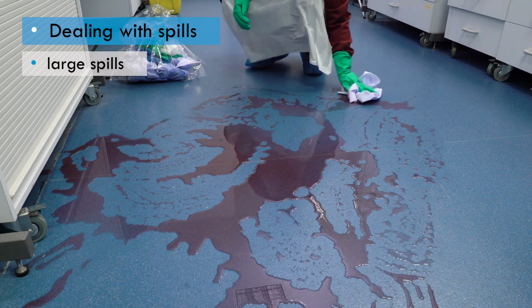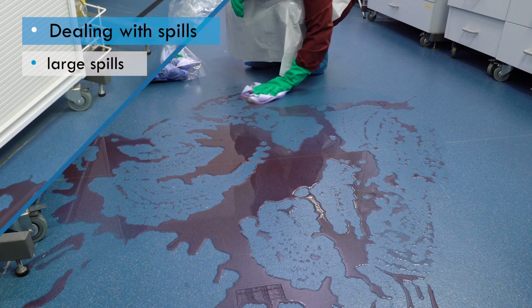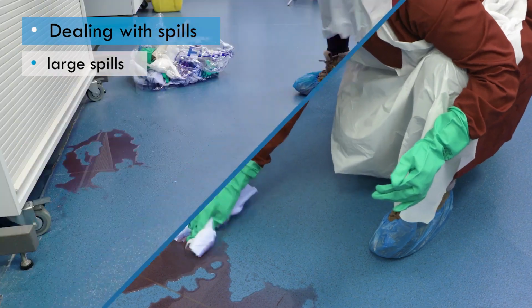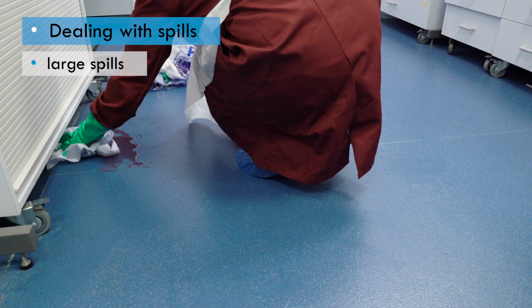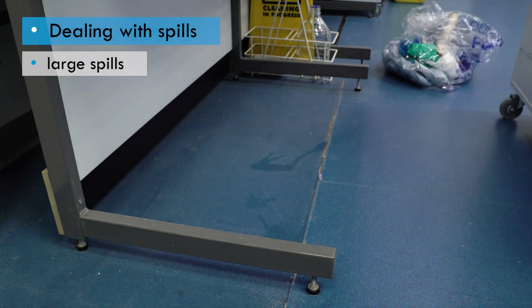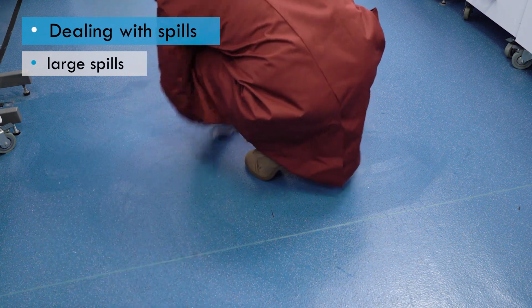Where a large volume of proteinaceous material has been spilled, such as blood or broth, the disinfectant concentration and the contact time may need to be increased. In addition, the disinfectant should be applied to a wider area than the spill. You may need to move furniture or equipment to make sure you have located all of the spilled material. The surface must be dry before work is resumed.